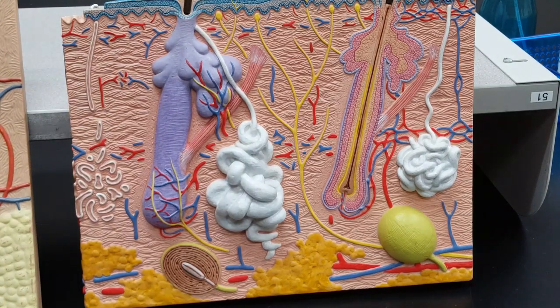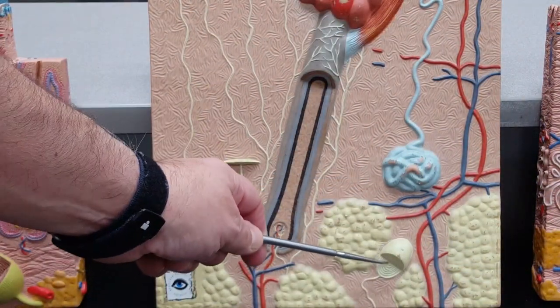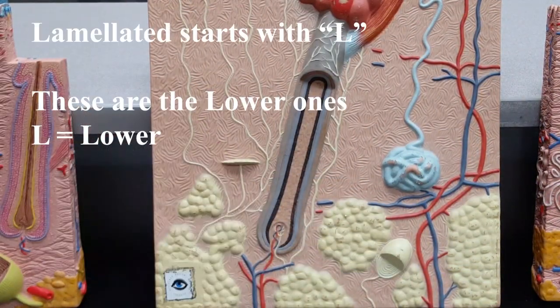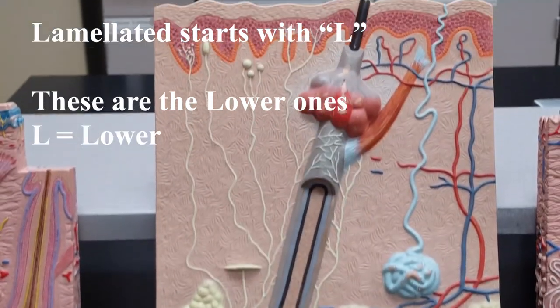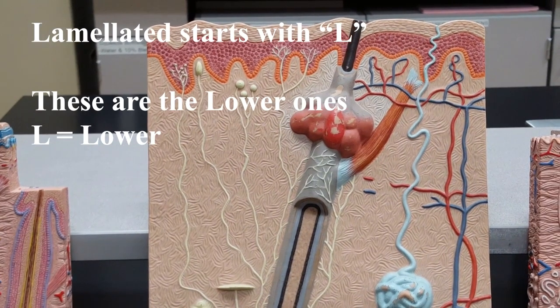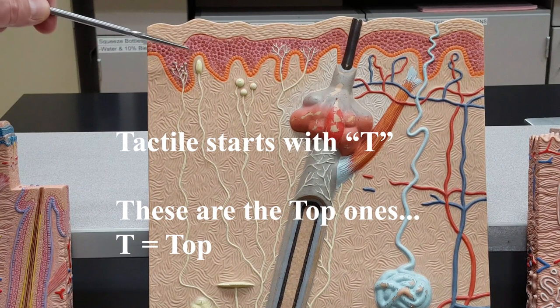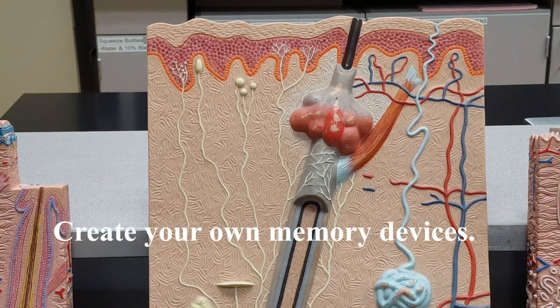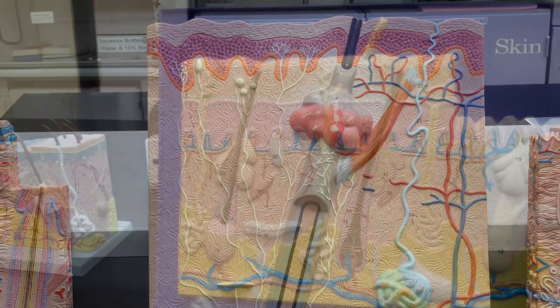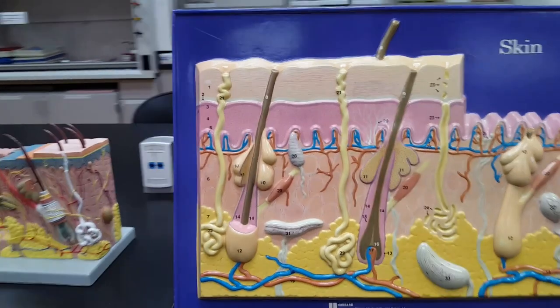I think you're getting it. One more. Lamellated corpuscle. Again, always look for those rings. Tactile corpuscle right here in the papillae. Sensory receptors, tactile receptors in your skin. Next up, we have some hair issues.